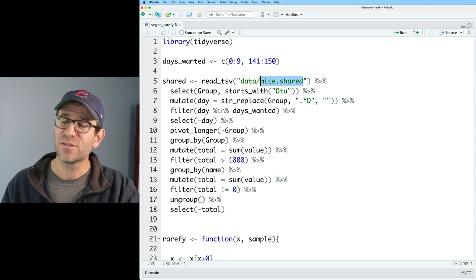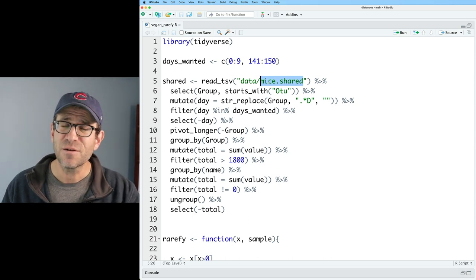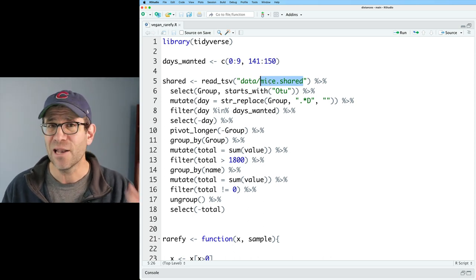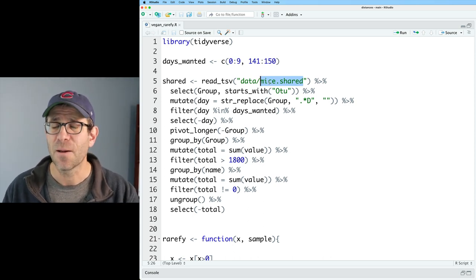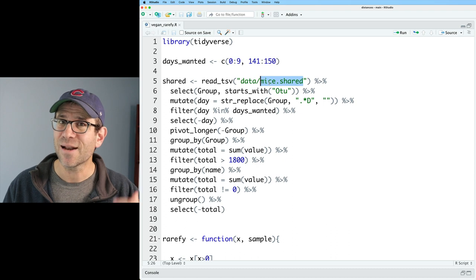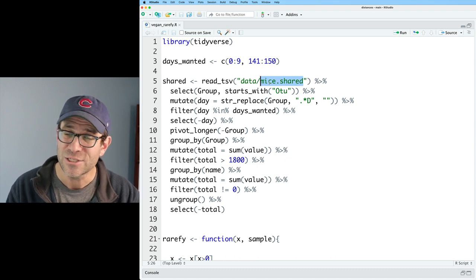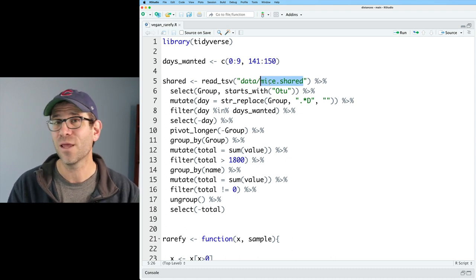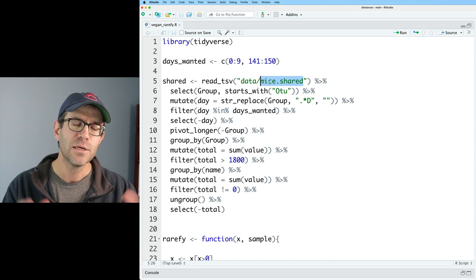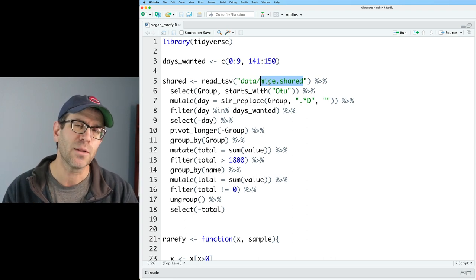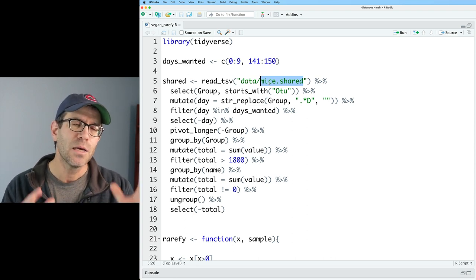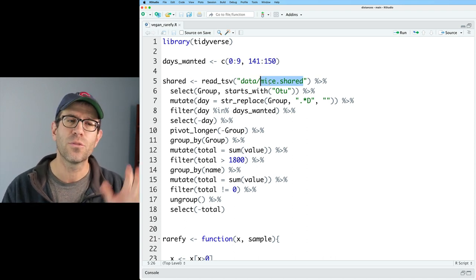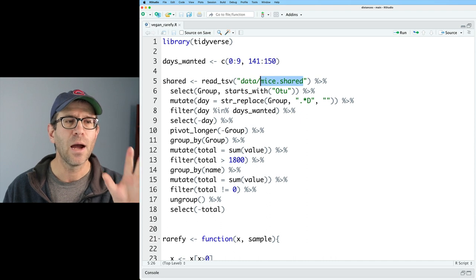Mothur also will do rarefaction for you. So if you're getting data out of mothur, you may as well just stay in there and do the rarefaction there. I realize that not everyone is working with microbial ecology data or even using mothur if you are using microbial ecology data.